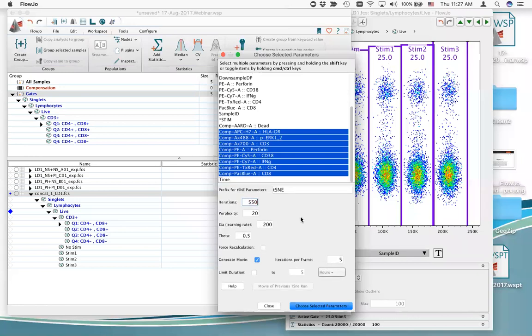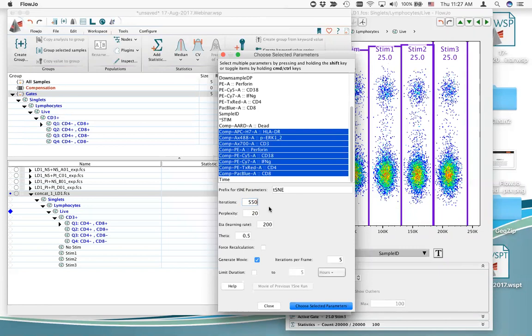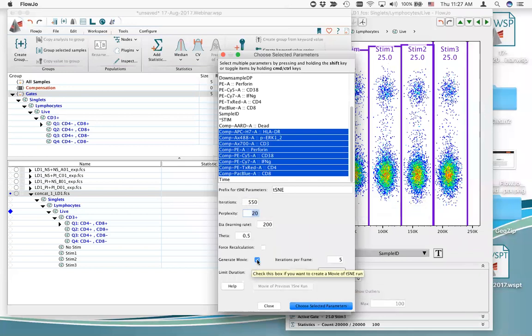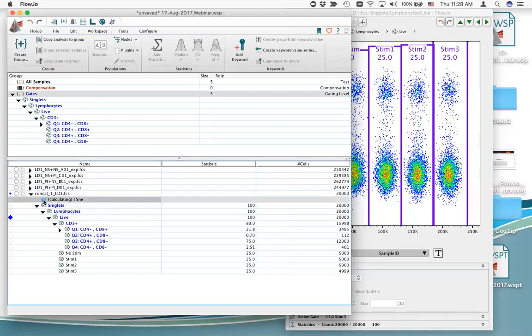Make a few changes to the algorithm settings. The iterations is the number of cycles the algorithm goes through — I know from experience that things separate well at about 550 iterations; going longer causes the data to spread further apart. The perplexity is the number of events each event pushes and pulls off as the algorithm calculates — I'll leave it at 20, but increase perplexity for larger numbers of parameters. You can also choose to generate a movie. To initiate the calculation, choose 'selected parameters' in the bottom right corner — you'll see a node with a star indicating it's calculating.